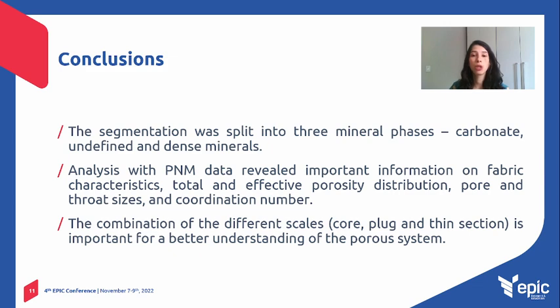The mineral segmentation was split into three mineral phases: carbonate, undefined, and dense minerals. Analysis with PNM data revealed important information on fabric characteristics, total and effective porosity distribution, and also pore and throat size and coordination number. The combination of different scales, core, plug, and thin sections, is important for a better understanding of the pore system. Furthermore, it is possible to associate it with the lithology or diagenetic process that occurs in the core interval.